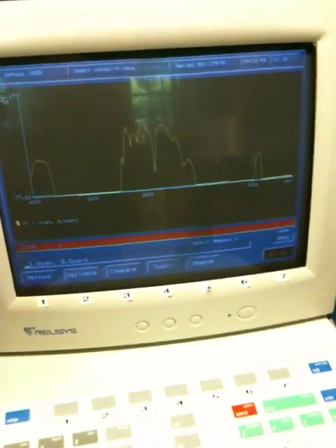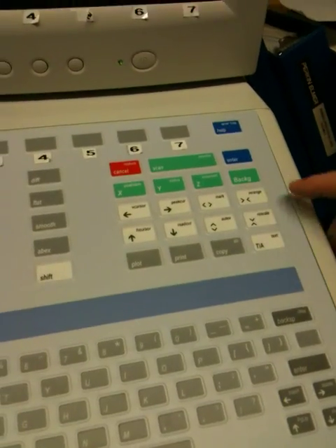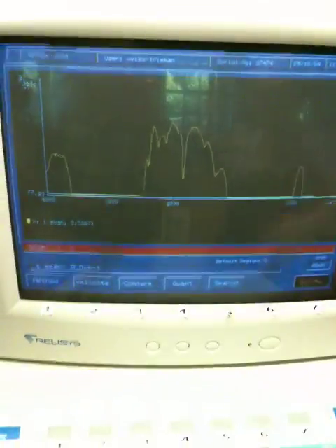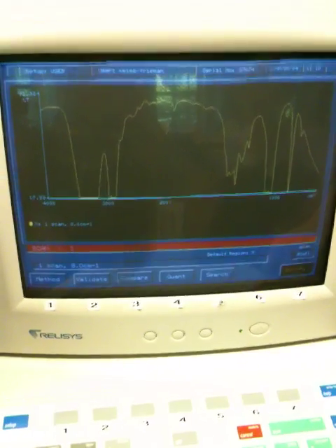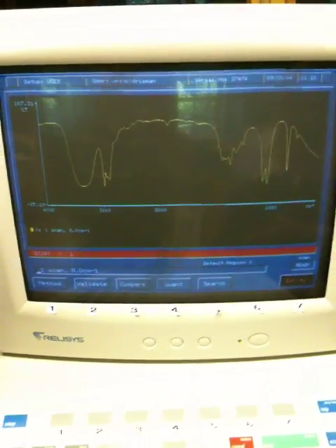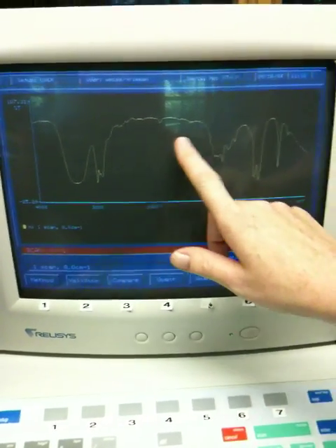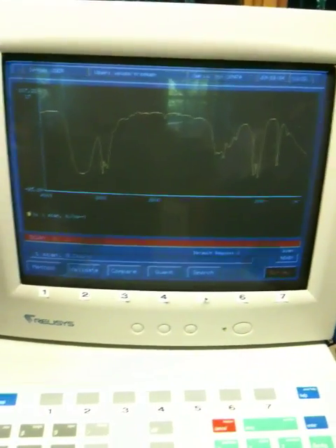What's wrong with this spectrum? It's way off scale, so I have to rescale it. I'm going to take this button because it's too vertically expanded and bring the expansion down, then move it up so I can see it. A little more. This is a very nice spectrum of ethanol — liquids are very easy to run, as are films. This is the OH peak, these are CH peaks, and this region is very characteristic of ethanol. In class, we're actually going to look at something similar to this.